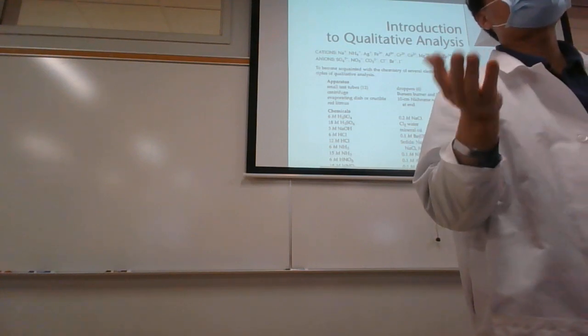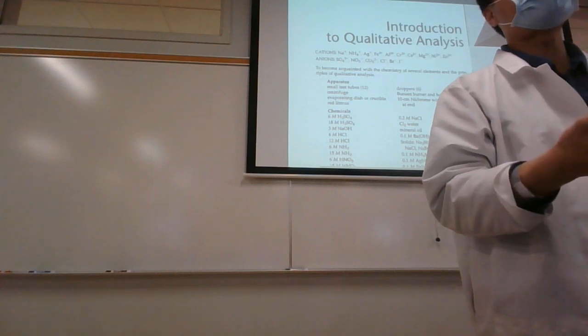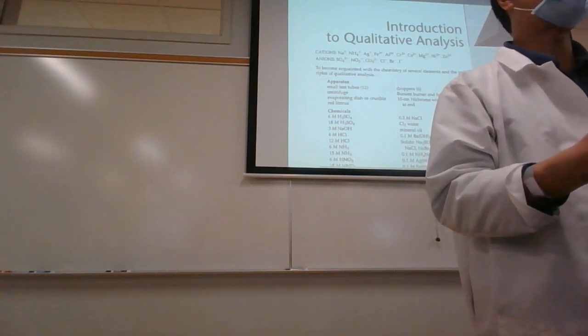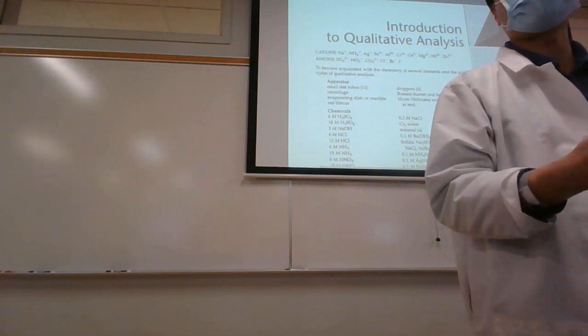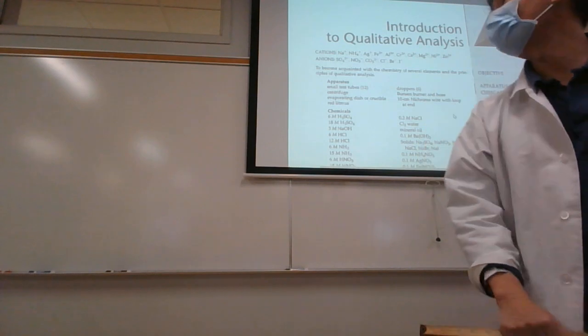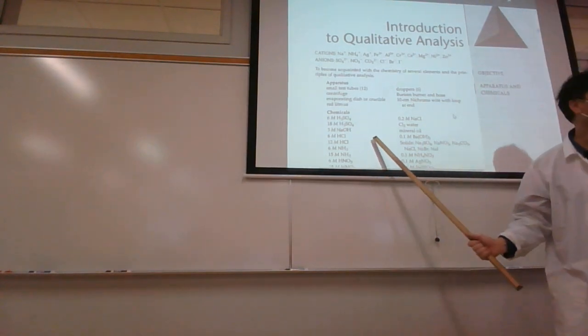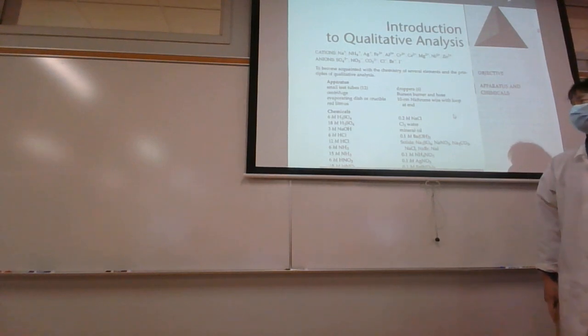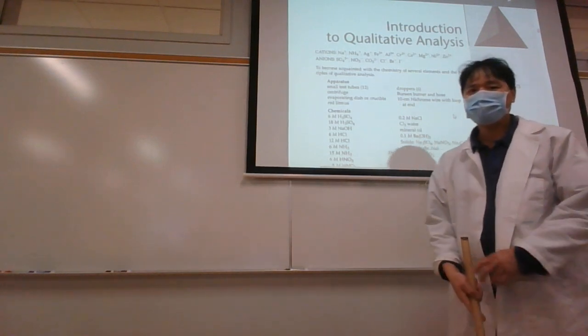What types of observations do you need to take in your notebook? The types of observations you need to take in your notebook are enough observations so that you can repeat the experiment. So let's see if you could repeat the experiment based on your observations that you took for your known, without having to go back to the procedure and look at the procedure to figure out what you were doing. The observations should be adequate enough to do it.